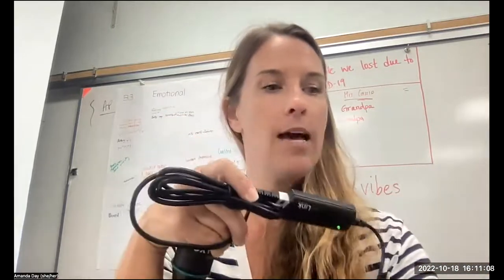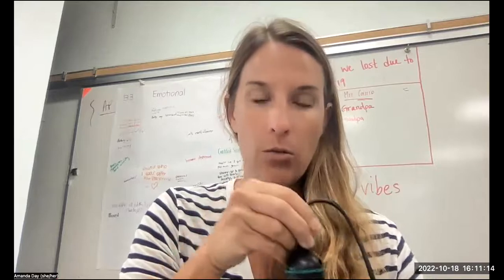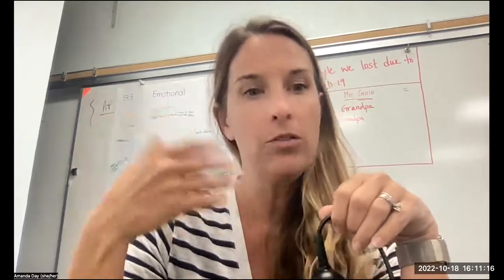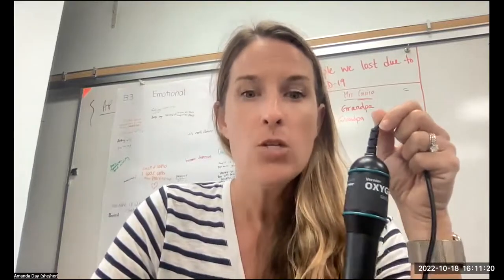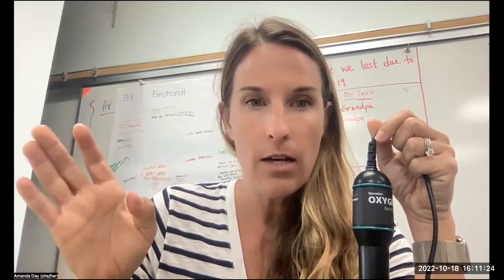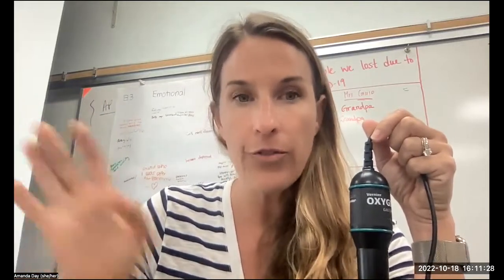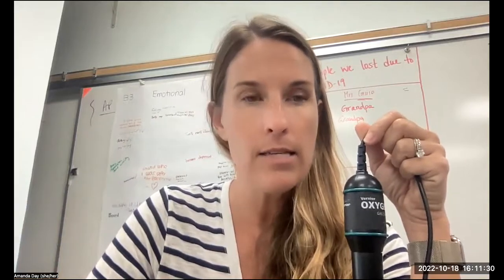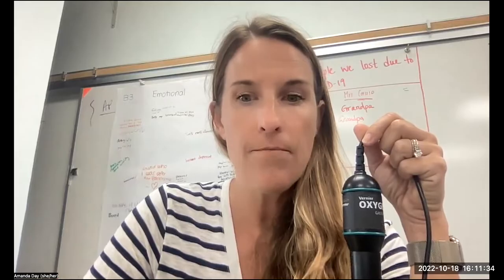The Go Link has a USB input. So whatever computer you use for this lab will need a USB port. So if you have a MacBook, you'll need to bring a dongle if you don't have a USB port. Okay, so you've downloaded some software from Vernier, Graphical Analysis. And we're going to use that right now.